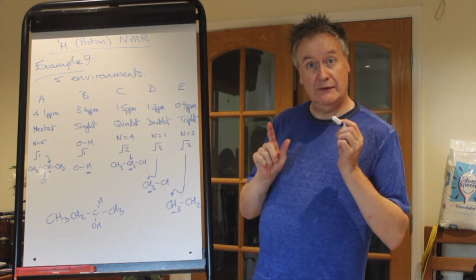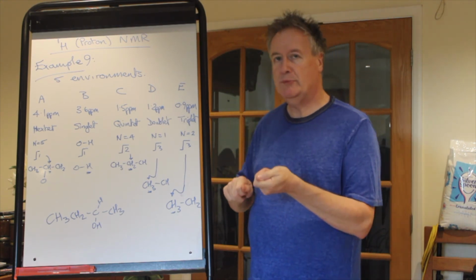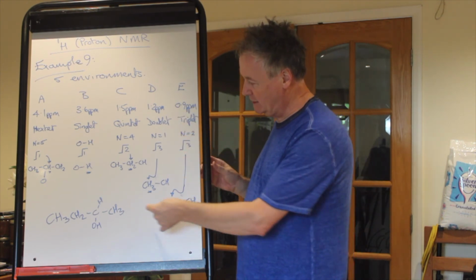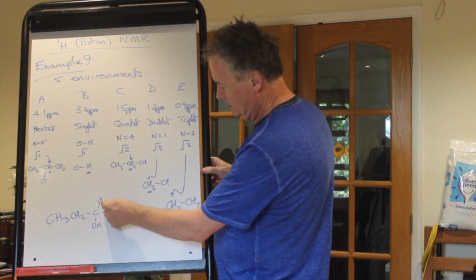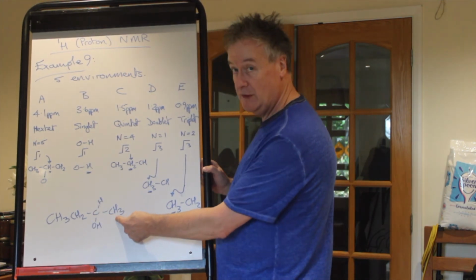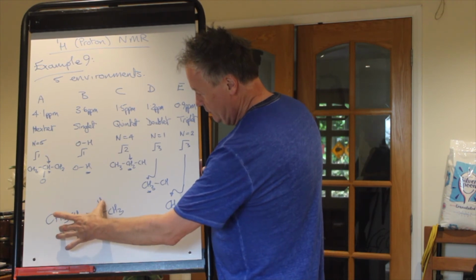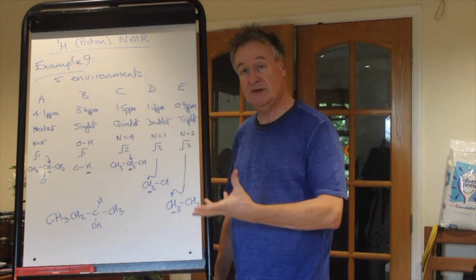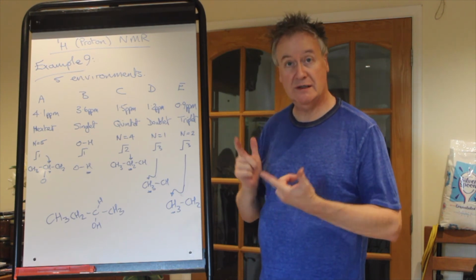Now that may put you out of your misery, but I also want to show what happens when you propose the wrong molecule. So when you piece the evidence together, you propose butan-2-ol. What you then do is you go, oh, that will be a doublet, that will be split by 5, so that makes it a hextet, which you're seeing. And similarly that is split by 4, which makes a quintet. That is 3, split by 2 makes it a triplet. So it matches what you're seeing, everything matches, the right sort of values for shifts, everything fits together, it's butan-2-ol.